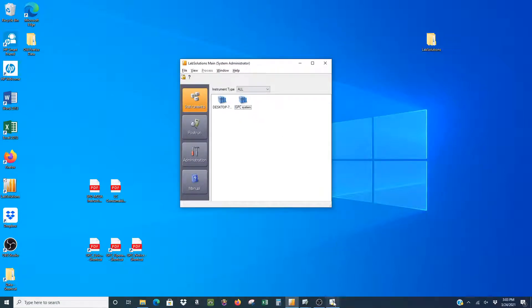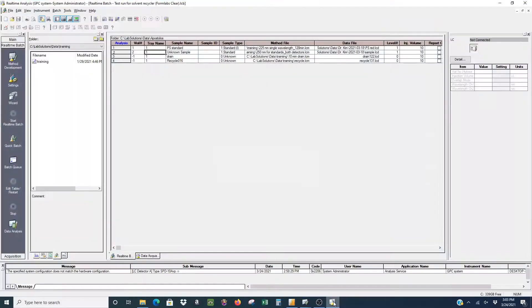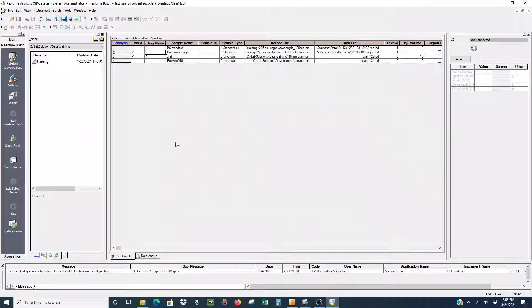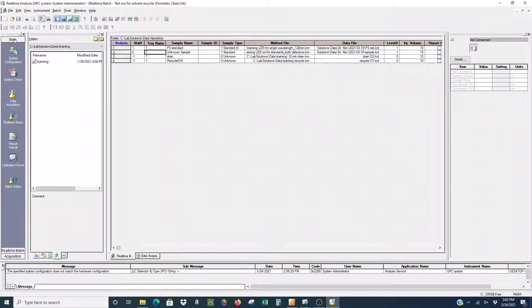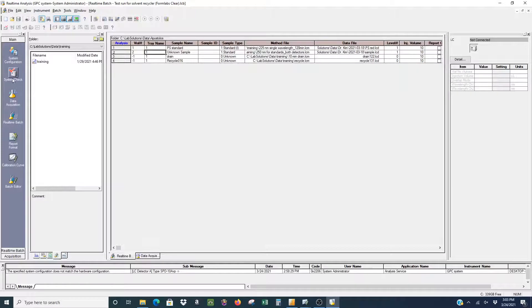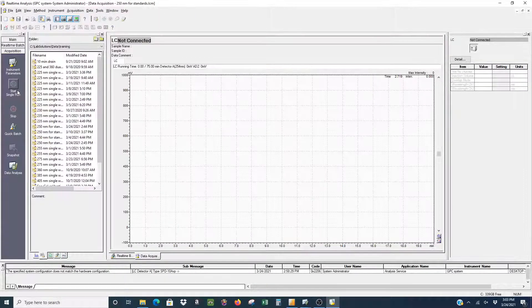This will open another window. In this window, you have to go to the main and then Data Acquisition on the left-hand side.